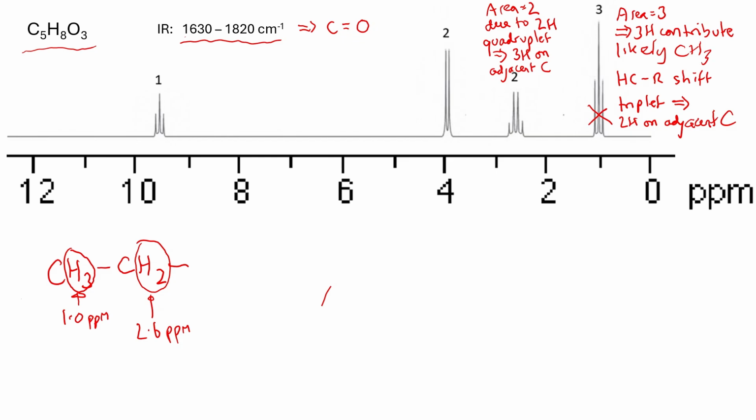So the chemical shift here is between 2 to 3 ppm, and if you look at that on your datasheet, it tells you that that could mean it's next to, for example, a benzene ring or a nitrogen, but you haven't got either of those in the structure, so the only thing it can be is next to a carbonyl group.